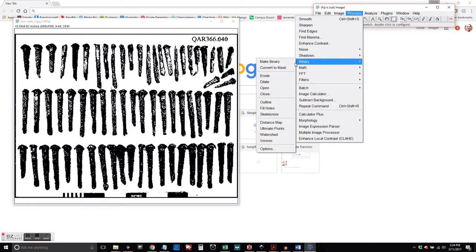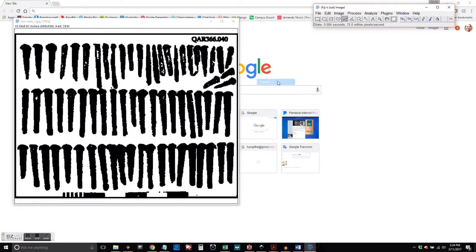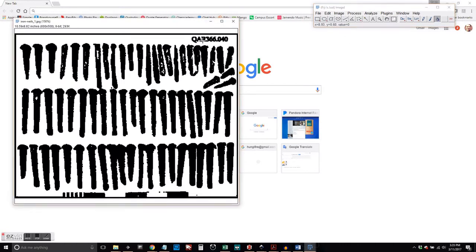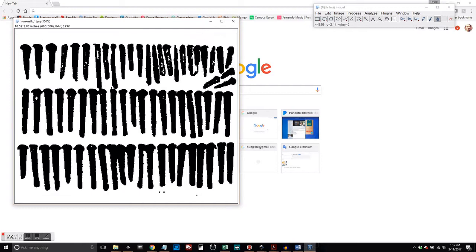So once we've done that, we go ahead and we're going to dilate the image. And that's going to help us close off gaps. We're going to grab the Paint tool and get rid of the extraneous data here, like the little dots.